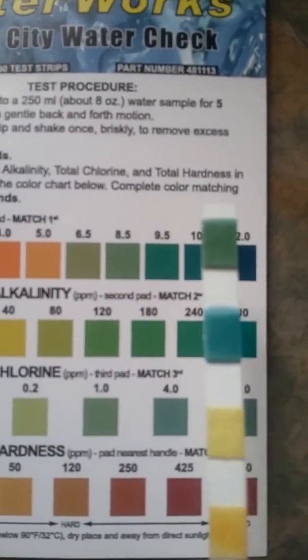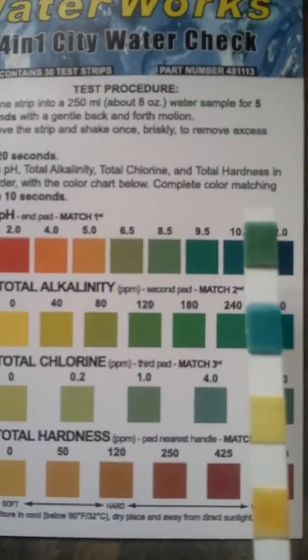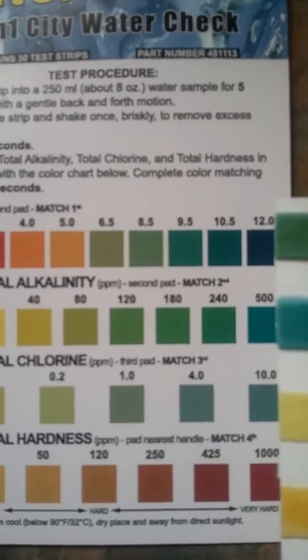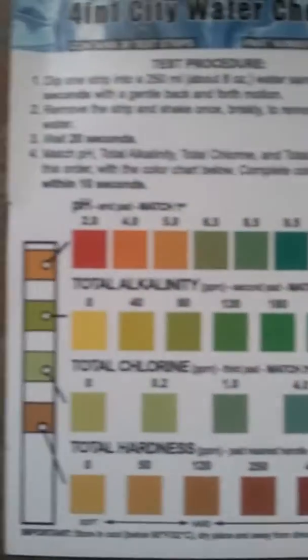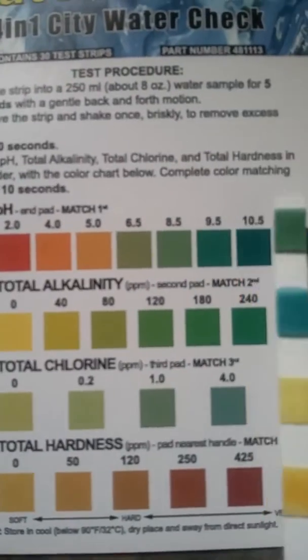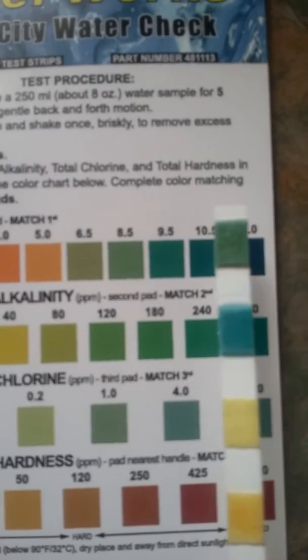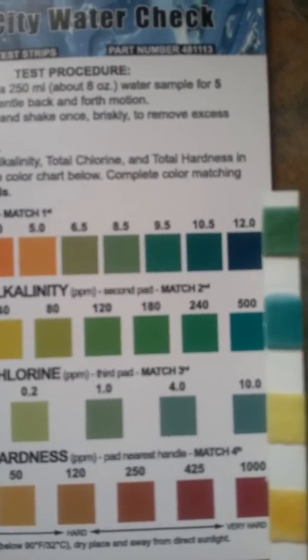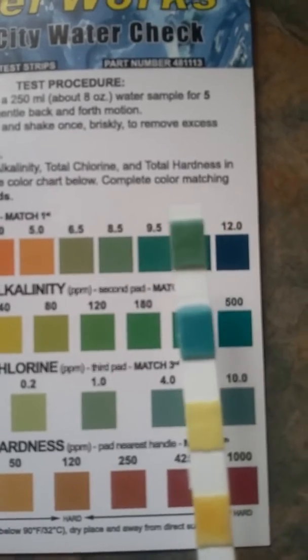The alkalinity is shown in parts per million. It's more on the blue side, so it's not quite 500 — it's in between 240 and 500 parts per million. That's very good water coming out of the tap.